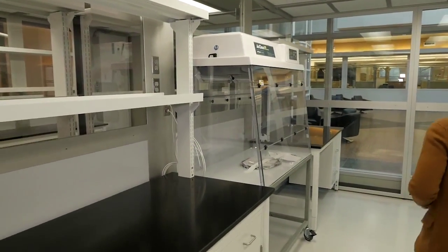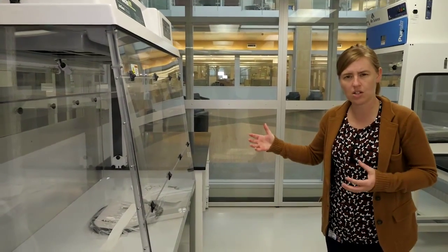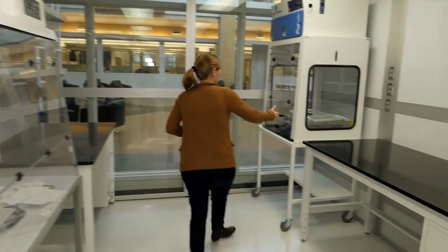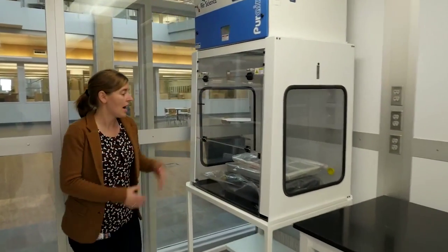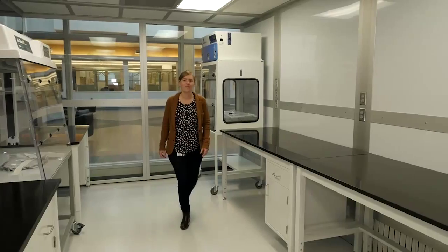We have special laminar flow hoods that protect the sample to an even greater degree. This is a very, very clean environment. And we also have chemical fume hoods that are mobile on wheels, again, in case we have to use any dangerous chemicals during this process. So after we extract the ancient DNA molecules, we need to prepare them for sequencing. We do the first step of that here, but the next step happens in the modern laboratories. So let's go talk to Dr. Lewis, who will explain how that works.